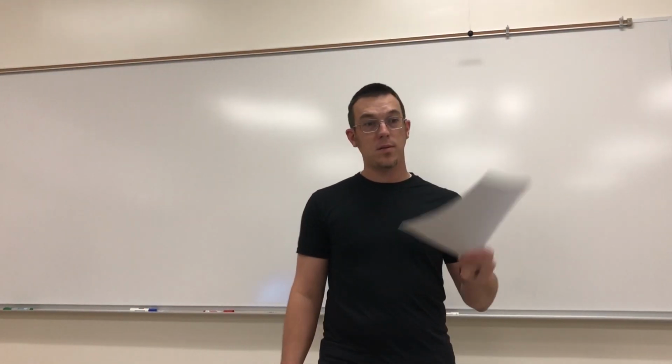Good evening, guys. This is your pre-lab lecture for the titration of acids and bases. This is going to be your take-home lab for tonight. So what I'm going to do is go through the pre-lab lecture, tell you how to go about doing the calculations and using the data that I provided you on the Word document.